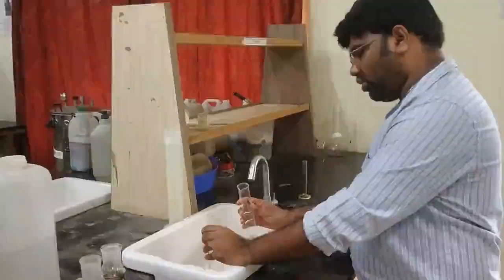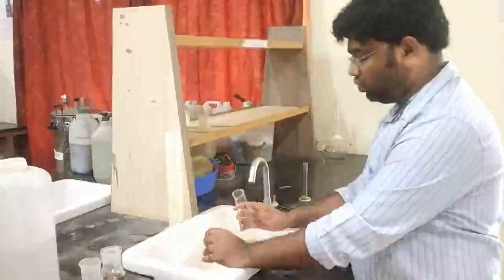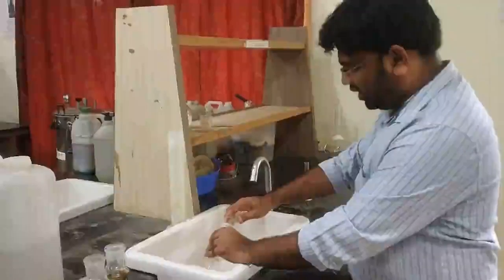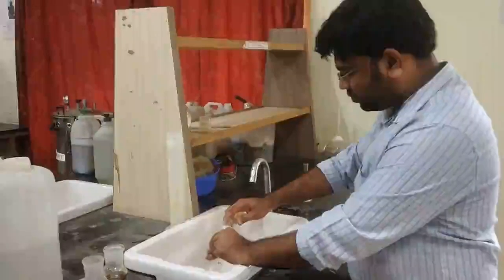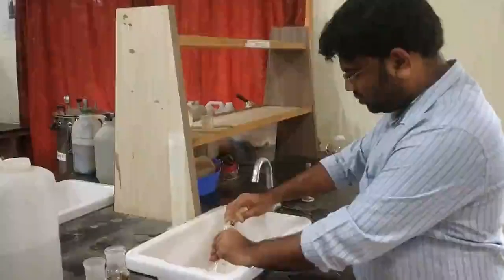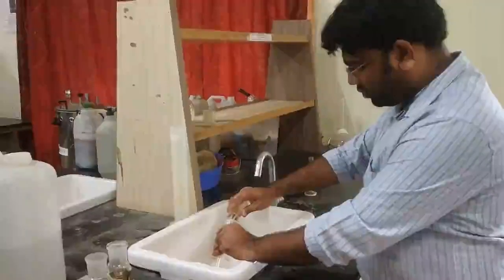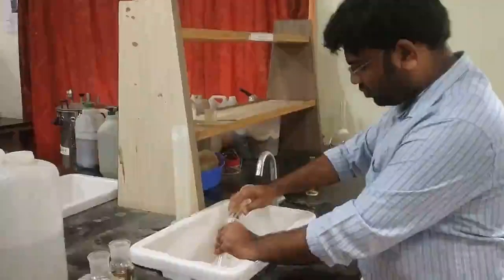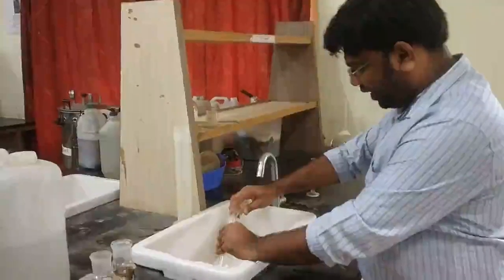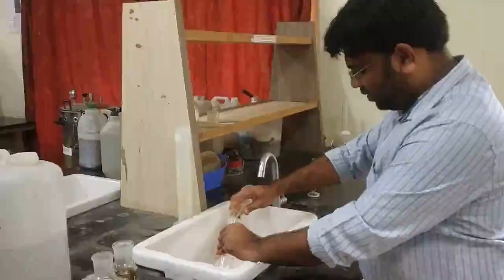And the fumes are not going to enter your nose. So with proper care, you will have less risk. A very slow addition of acid is recommended.